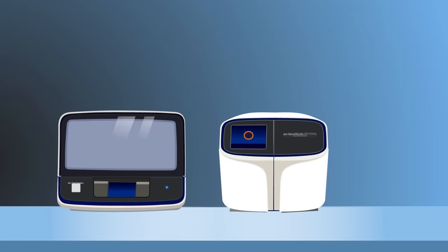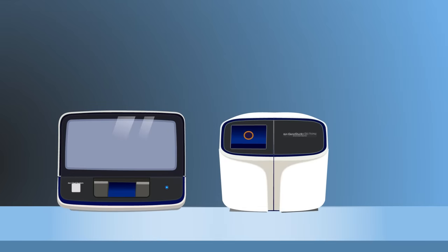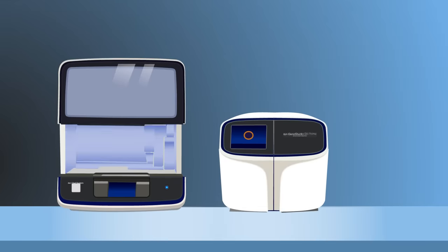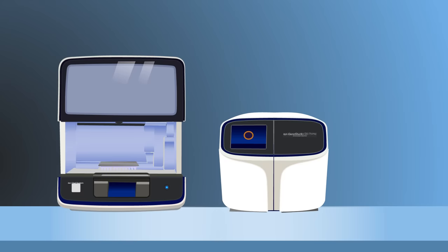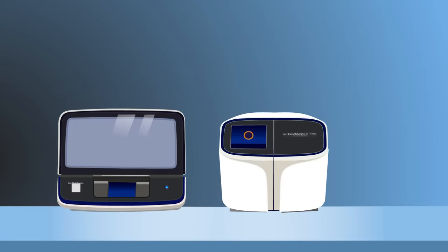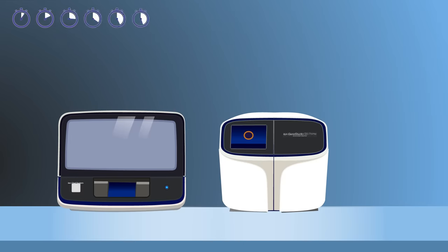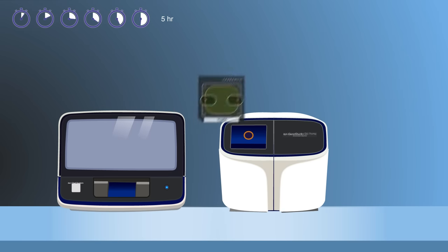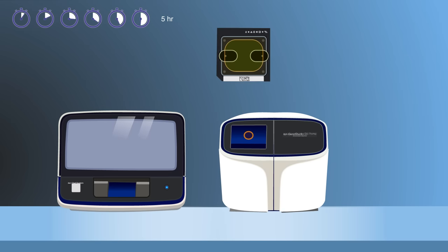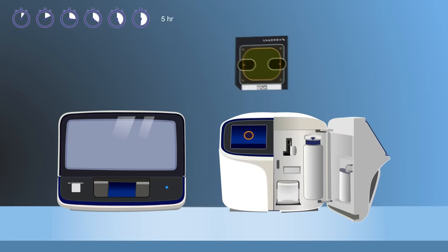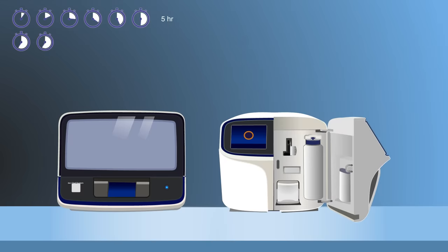These next steps leverage the automation efficiency of the Ion-Chef system. Load pooled samples and consumables into the system and press go for hands-free templating and chip sequencing preparation. Approximately 5 hours later, the prepared Ion-Chip is ready for analysis by the Ion-Gene Studio S5 system, and data is available in roughly 5 hours.